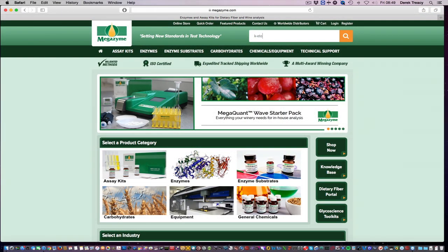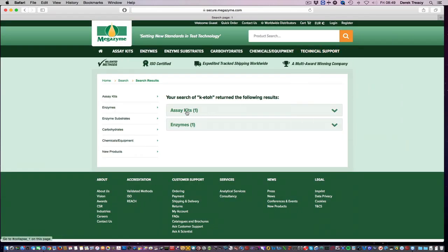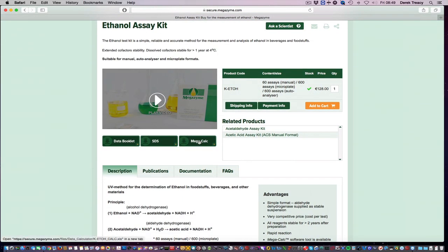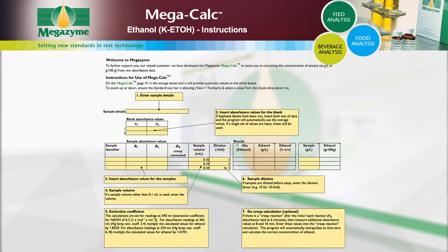MegaZyme has also developed specific Excel-based MegaCalc applications for each MegaZyme kit to allow quick and easy results analysis. Results can be analysed using the MegaCalc application specific to this ethanol kit, which is available to download free of charge from the MegaZyme website. The MegaCalc spreadsheet provides full instructions for use.